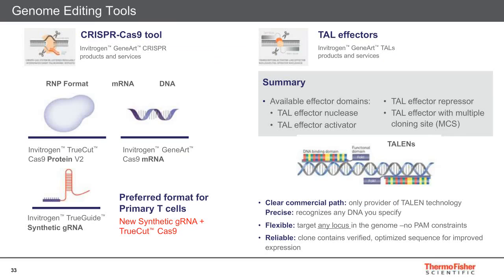So that's something we're actively exploring. The good news is we can already achieve 80% at day 3, which probably will really help our gene editing experiments when we can put DNA at that stage and be able to engineer T cells.